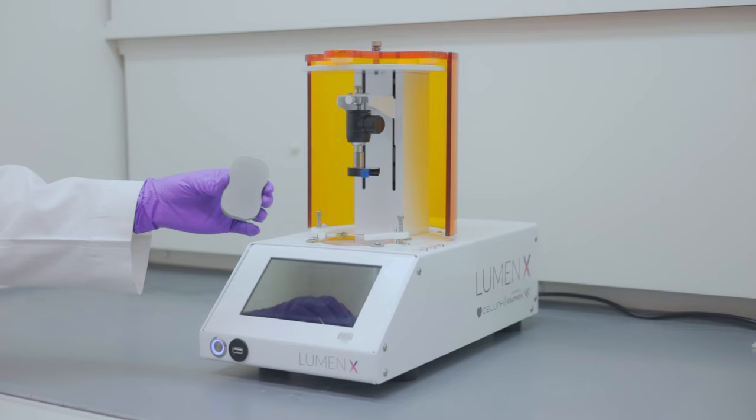To sterilize the build platform, soak it in 70% ethanol for 30 minutes and let it air dry.